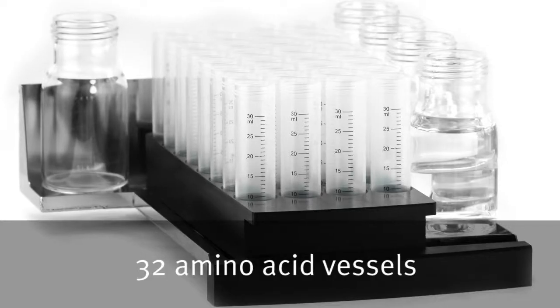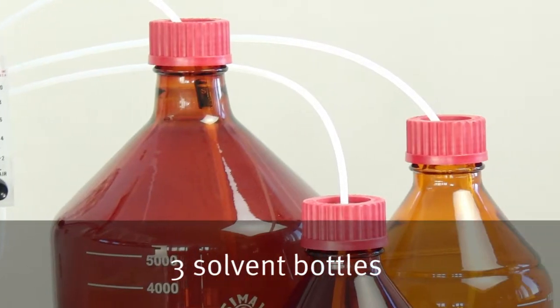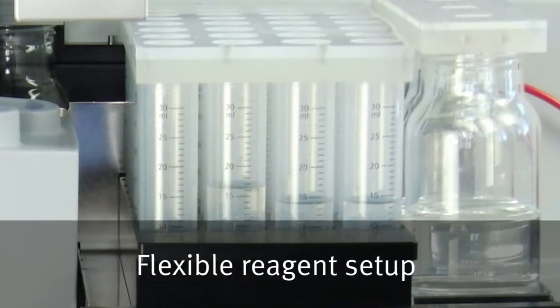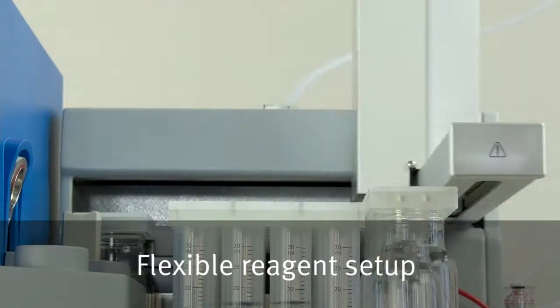The standard 32-position amino acid rack with 5 reagent bottles and 3 external bottles provides a completely flexible reagent setup, enabling greater versatility when deciding a synthesis strategy.